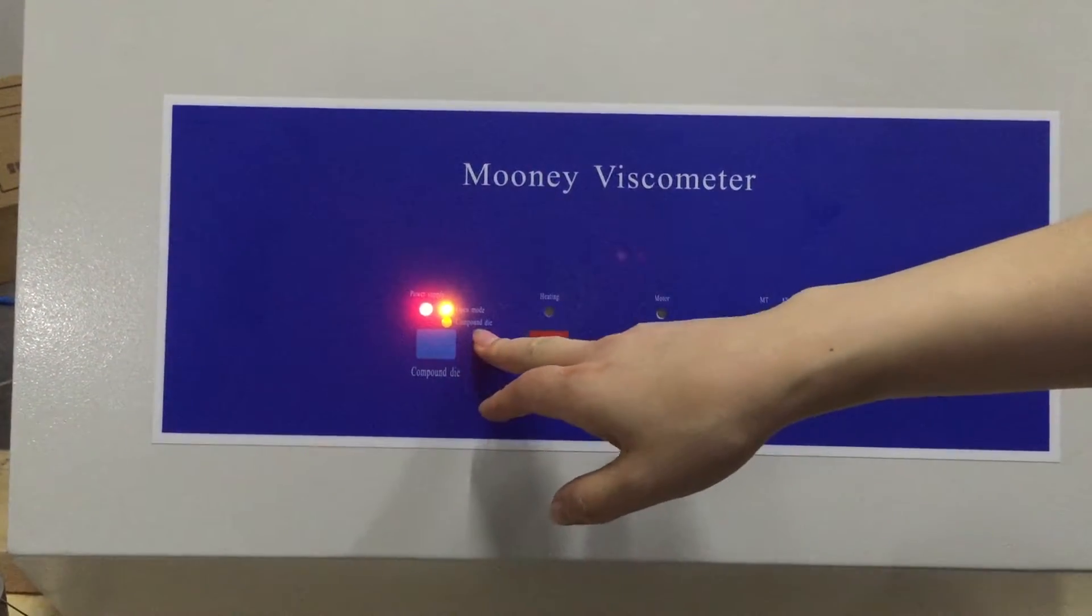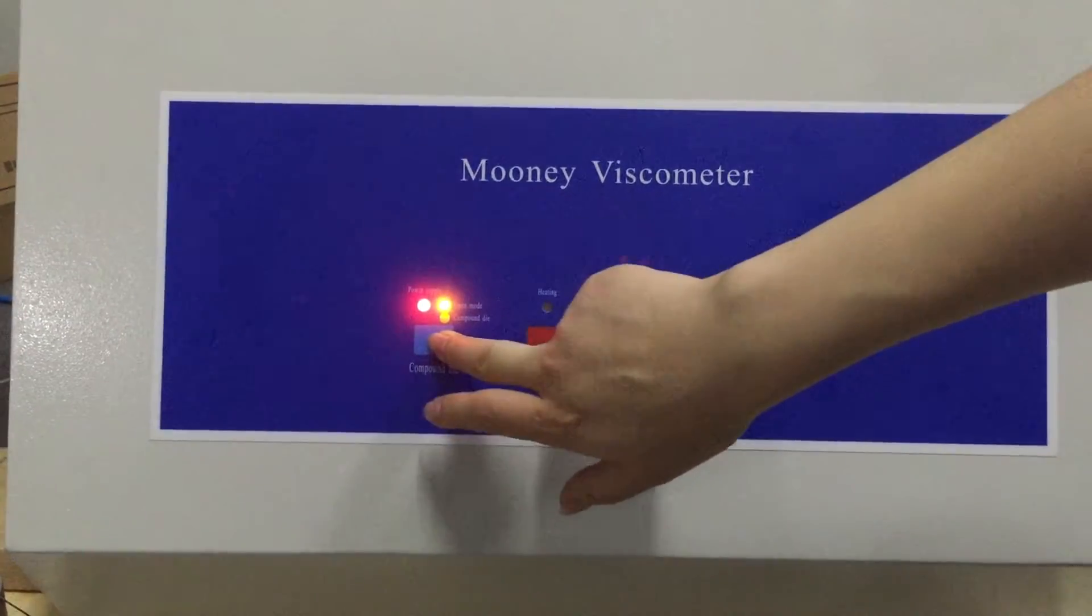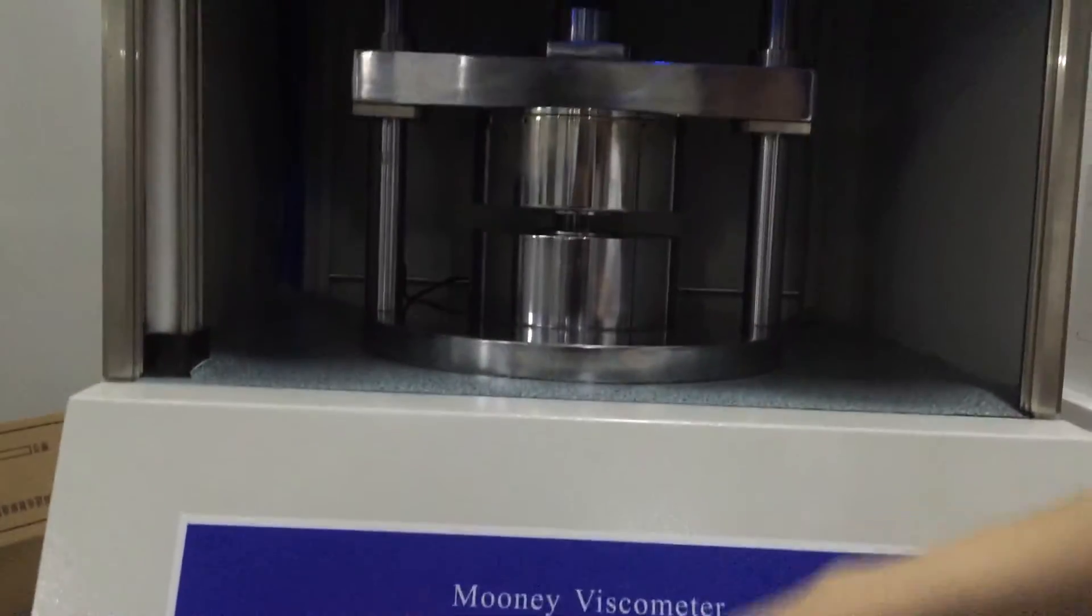And this one is to compress the die. If we click this switch, it will close and the door will close too. Then we press again, it will open the door.